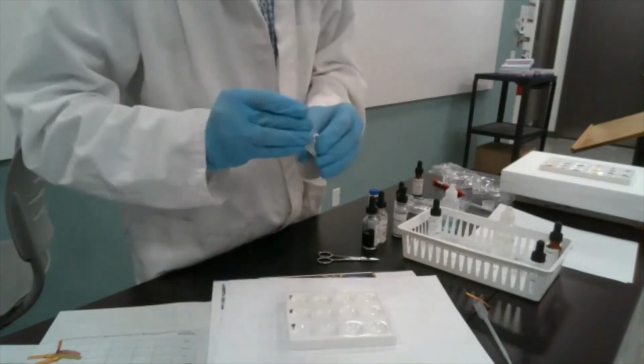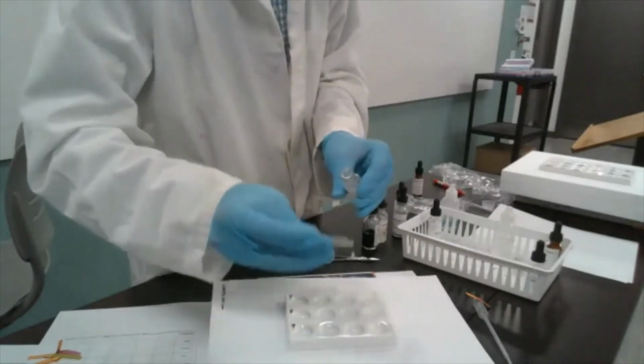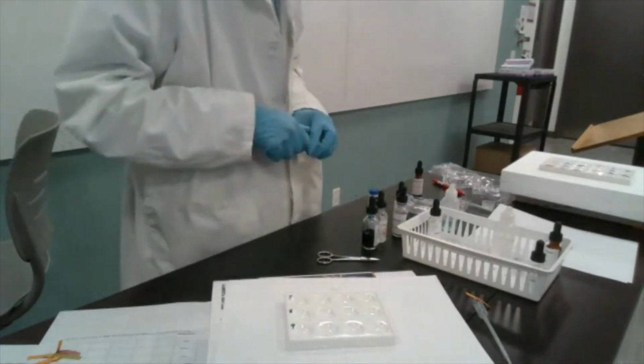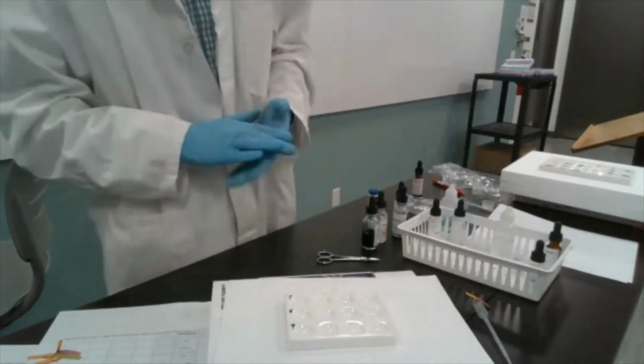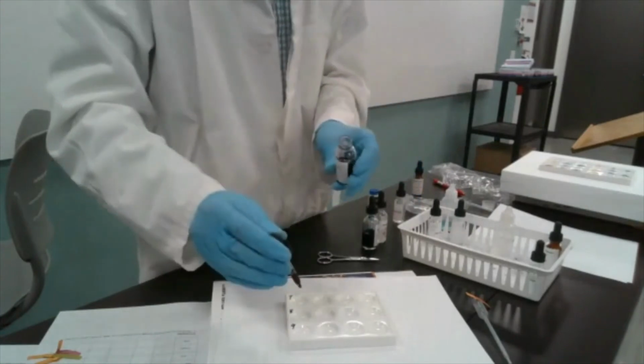but it shouldn't change the chemical properties as far as pH testing goes. So let's start with number 7, pop. Same indicators, starting with blue litmus.